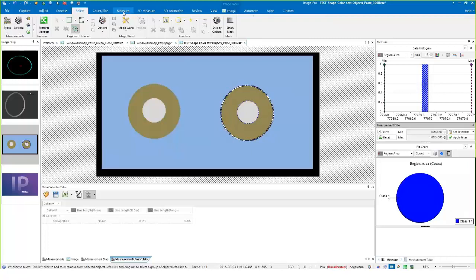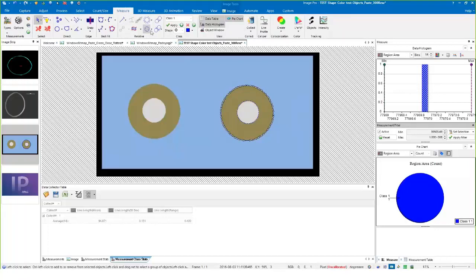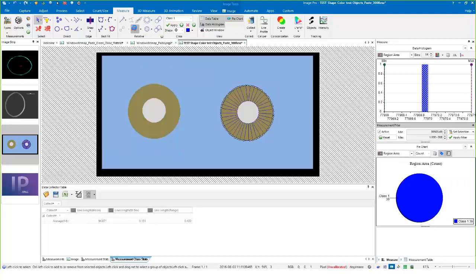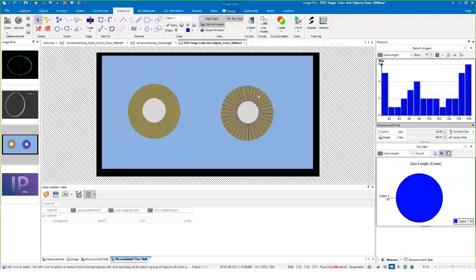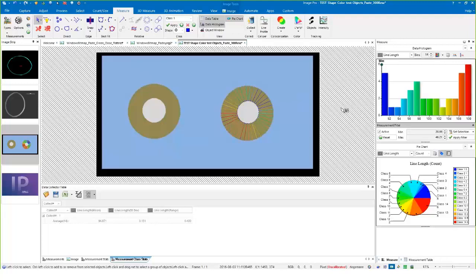Then go to Measure, and again the relative measurement of incremental distance becomes available. We can click on that, we get our line segments, they show up here again in the histogram. If I wanted to colorize them, I can visualize them here.